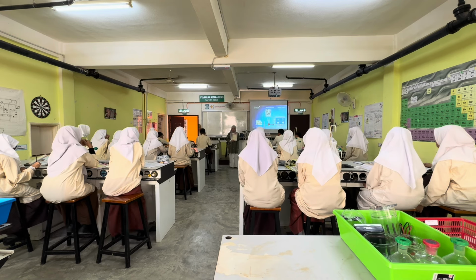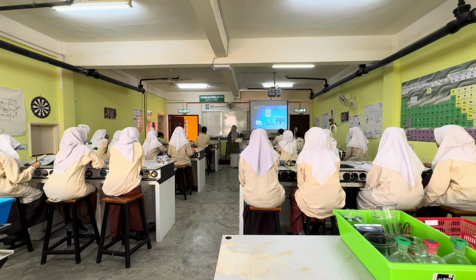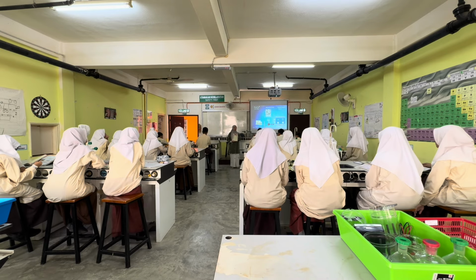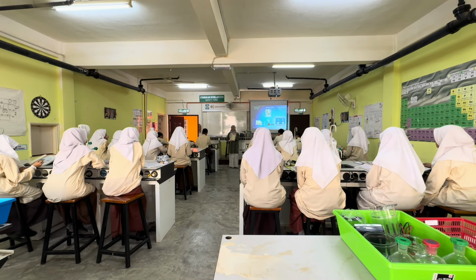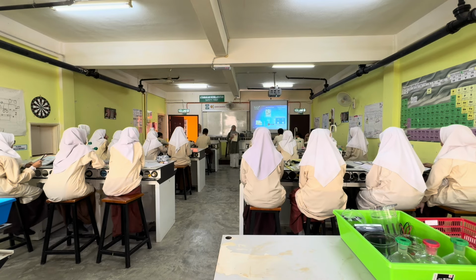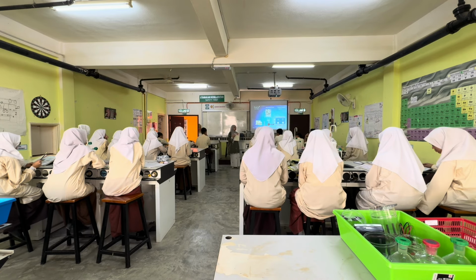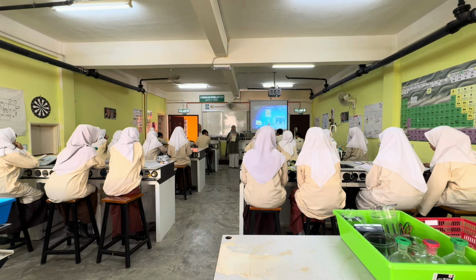Same number of spatula. Okay, good job. So the answer is, for now, we don't have any balance, so you cannot measure the mass of the salt. Okay? So I want you guys to just take one spatula, one spatula each of the experiments.